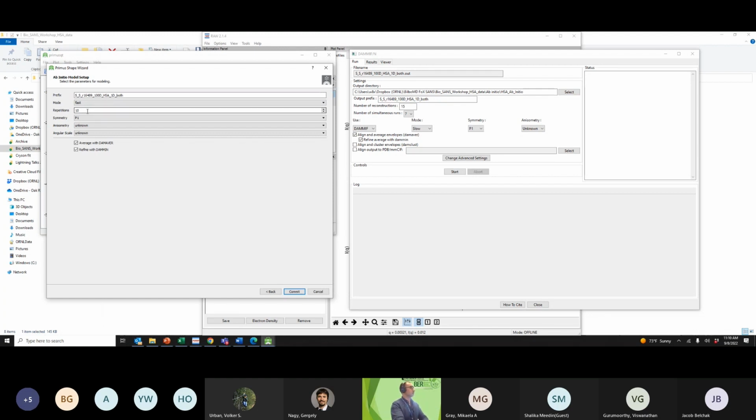You can use the number of repetitions you want here; 10 is just fine. If you have some symmetry in your data, for instance a hexamer or a trimer, you can apply the symmetry here and get the right shape that you expected.